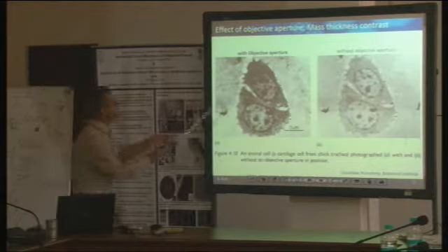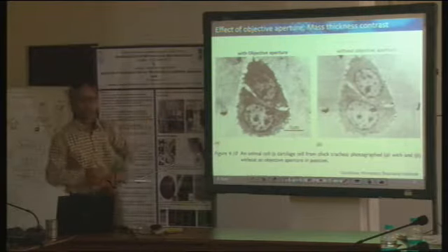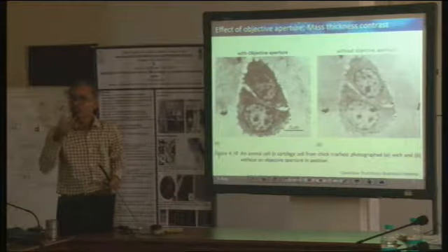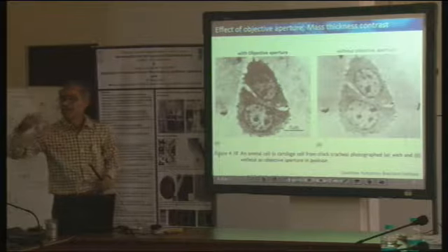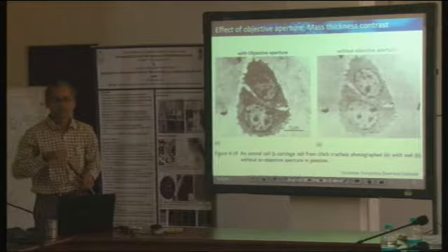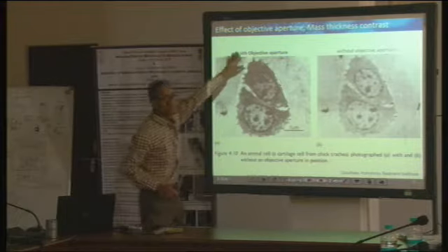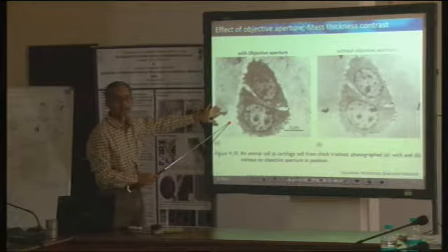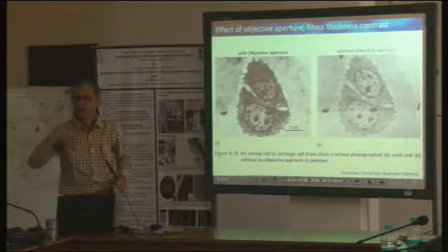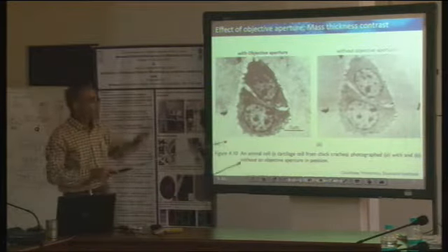image here. So this is some biological sample which may have also been stained, because some parts or components of the biological tissue tend to absorb this stain, uranyl stain or something like that. That's heavy. So they become very heavy, and the rest of the part doesn't do that. Now when I use an objective aperture, I get such a beautiful contrast. Yeah, because those parts of the cell which absorb that heavy element are heavy objects, so they will scatter a lot, and therefore they will appear dark. Correct?